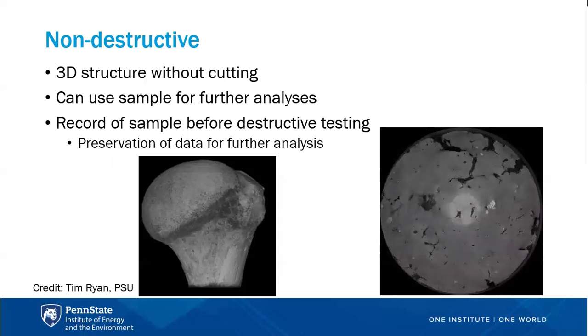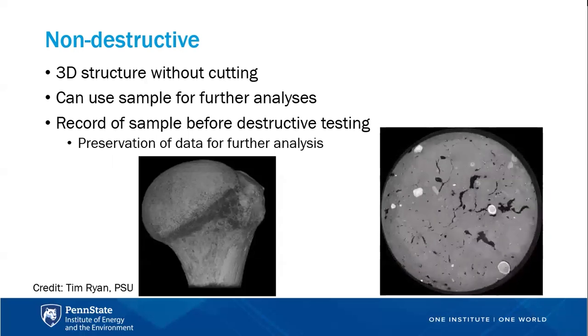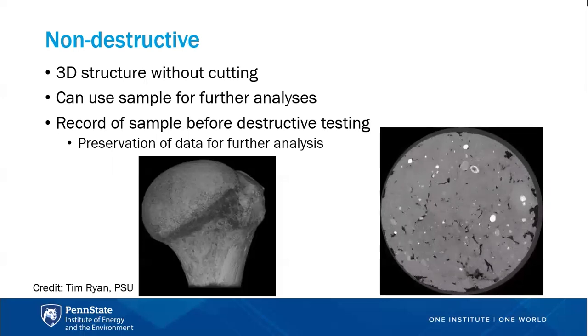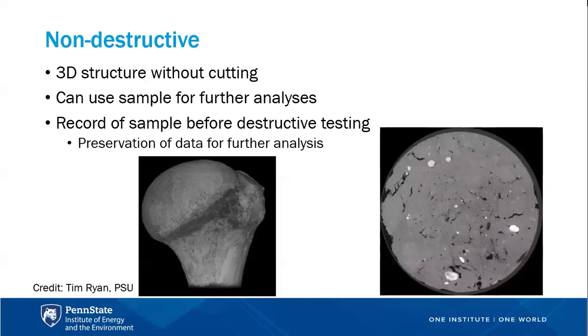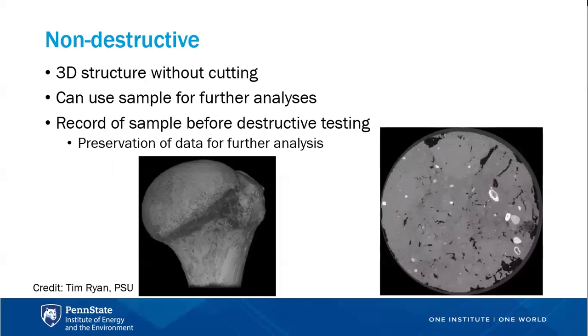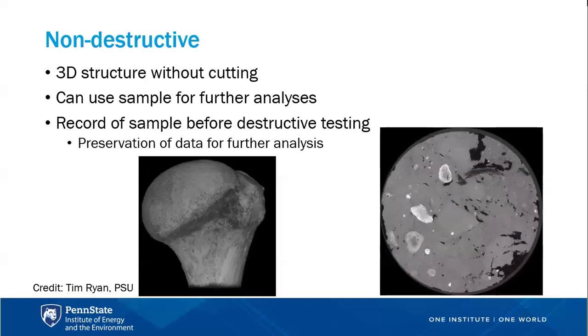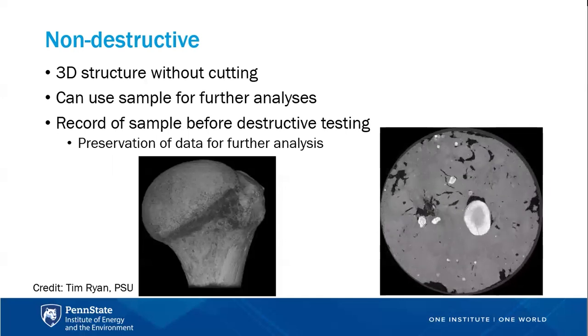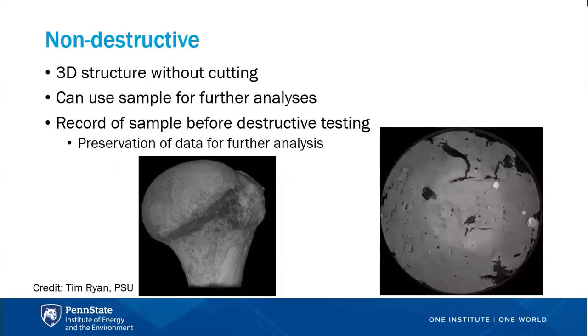The same thing, I'm a soil scientist. We take soil samples. We then have to destroy them to take carbon, nitrogen measurements. Not this sample, but other samples I've done, we've done 3 or 4 or 5 different pieces of work with those just off of one CT scan. So you can do a lot of things, and it's a really great record to have.